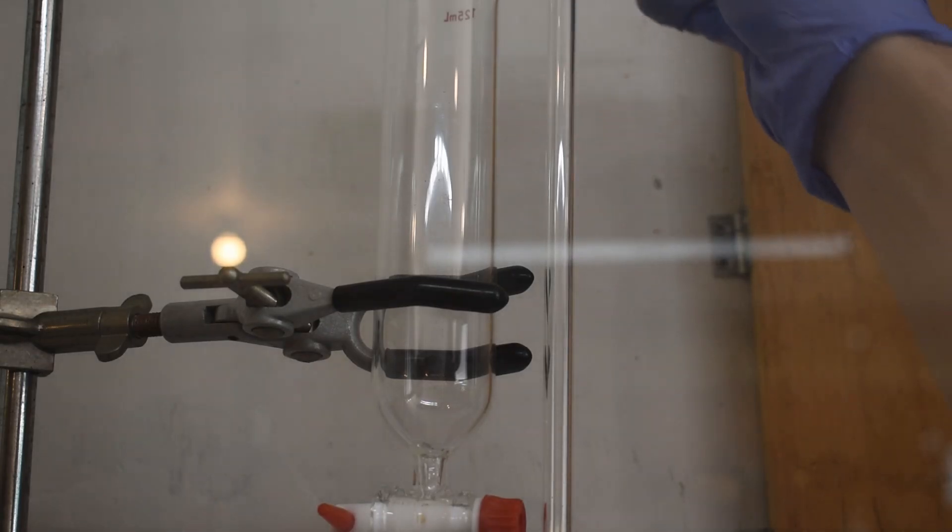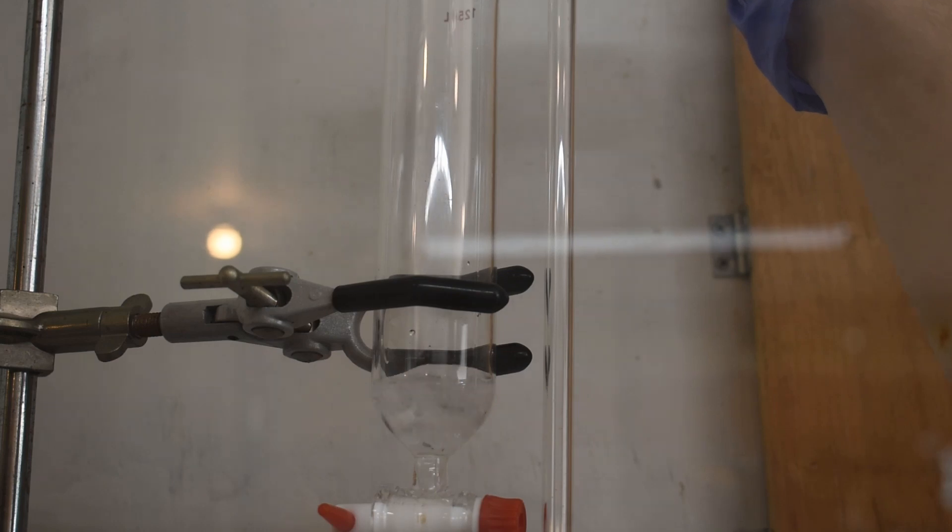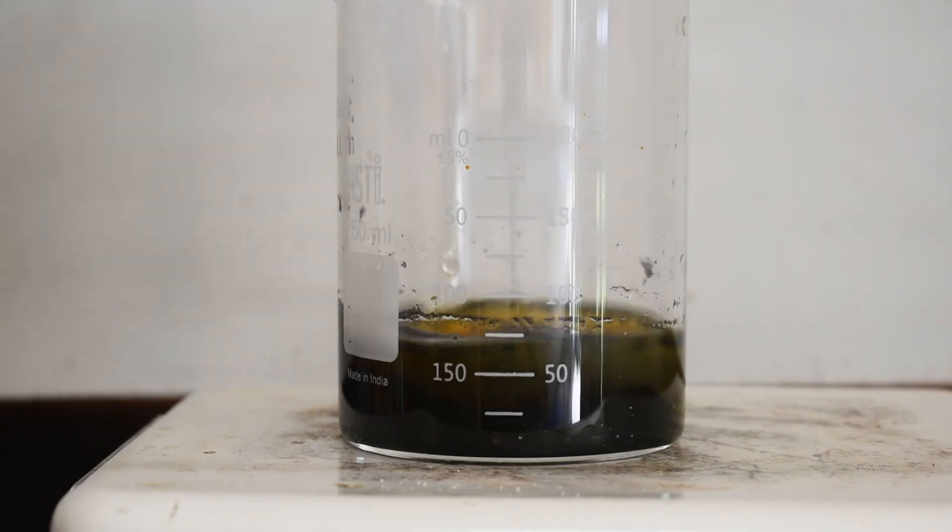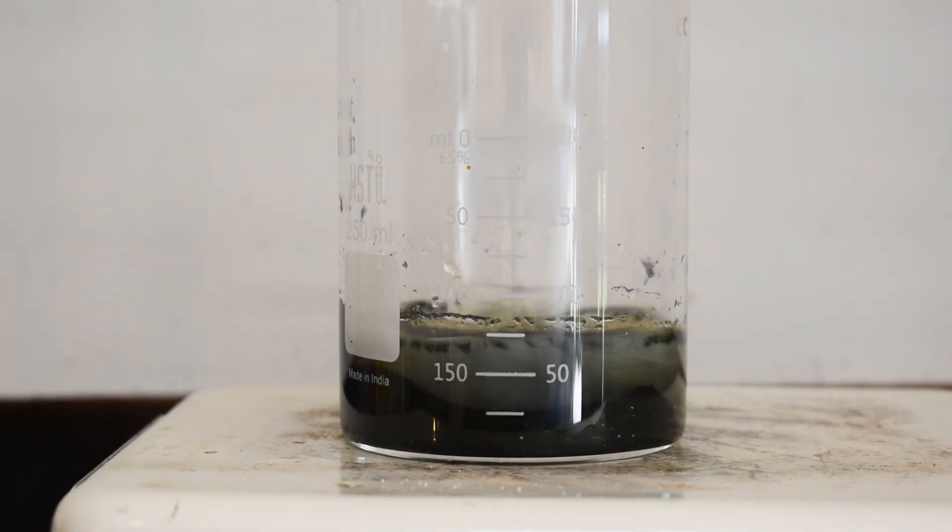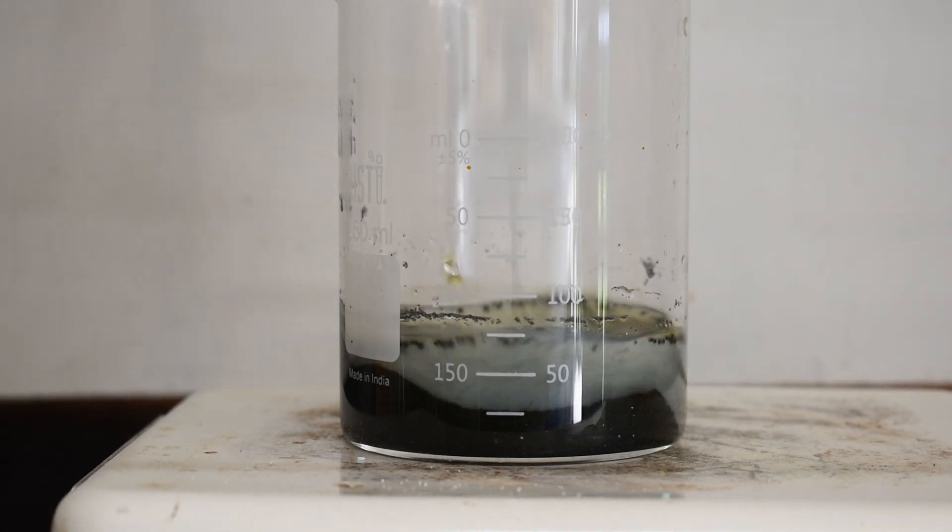Then above the beaker I situated an addition funnel and this contained a solution containing about 1 gram of sodium hydroxide. I then began to slowly drip in the sodium hydroxide and as you can see that causes the solution to go colorless for a minute, however the color will return.